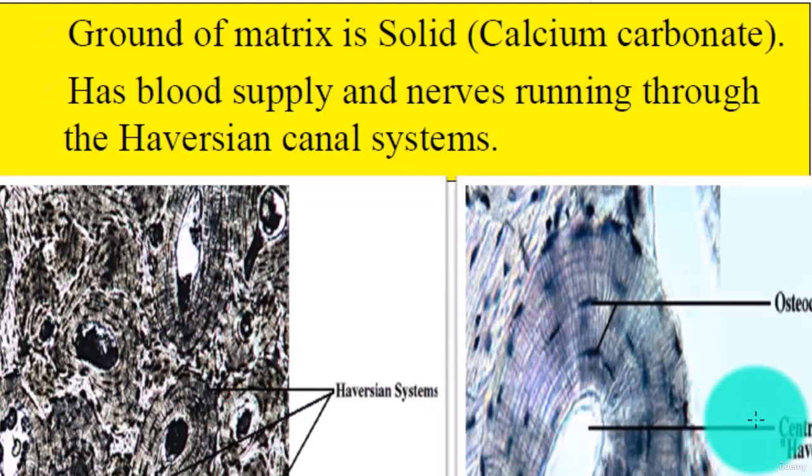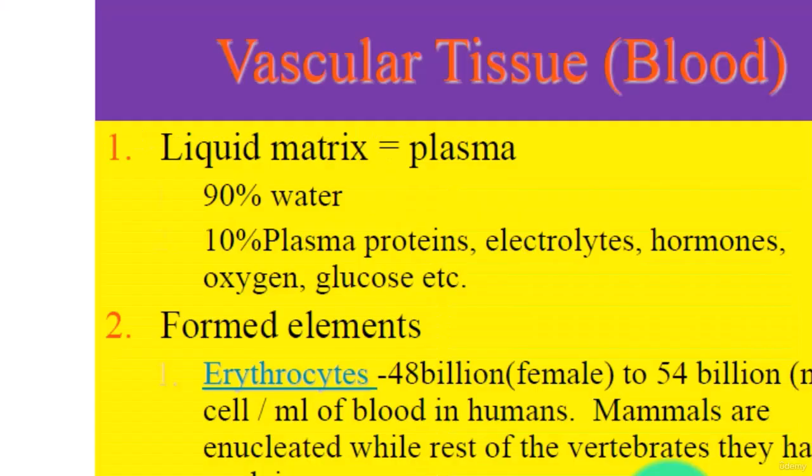This is the Haversian system: osteocytes and the central canal, the Haversian canal.